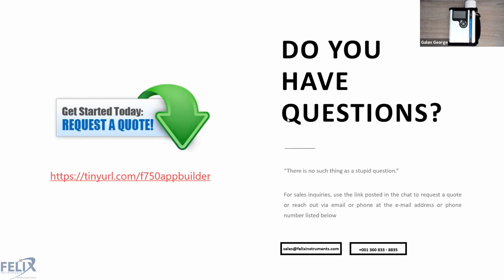The next question is, when importing measurement data files, the software is getting stuck, also with the latest version. So if you're having an issue, then please send a support ticket in through our website, and we will help you out with your issues directly. Thank you.